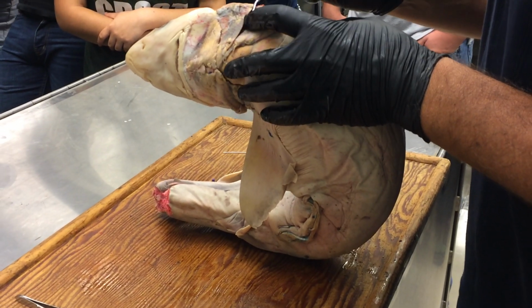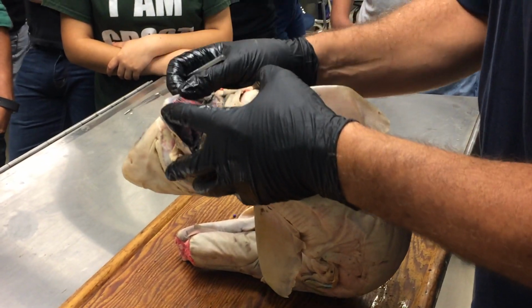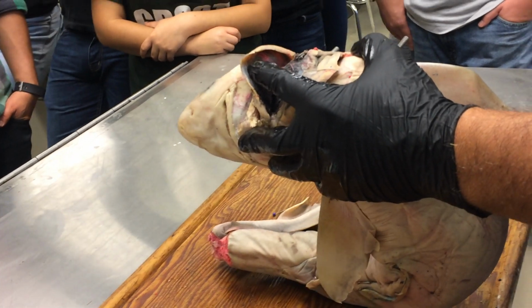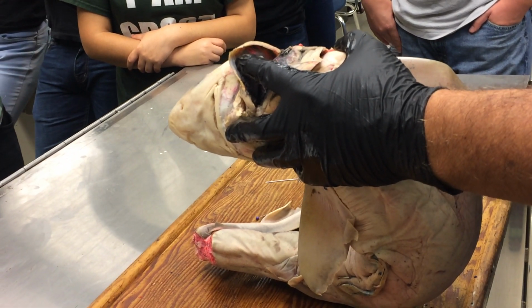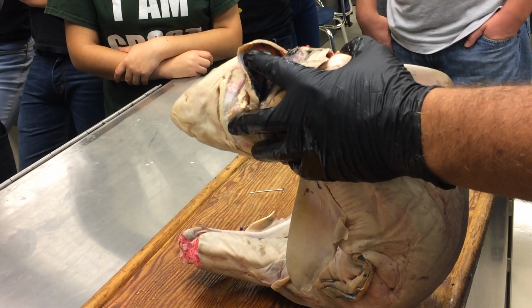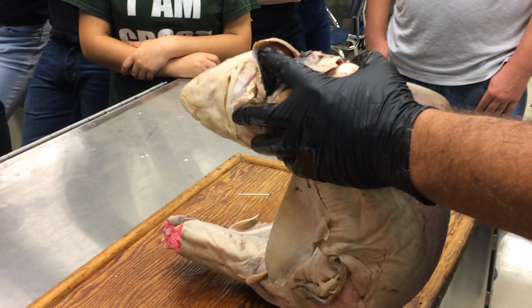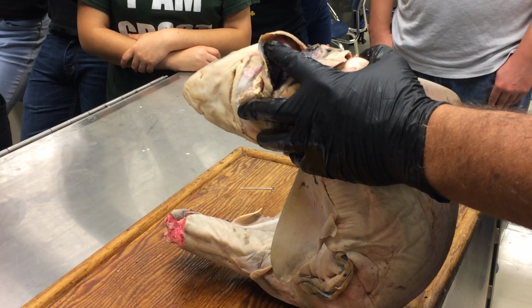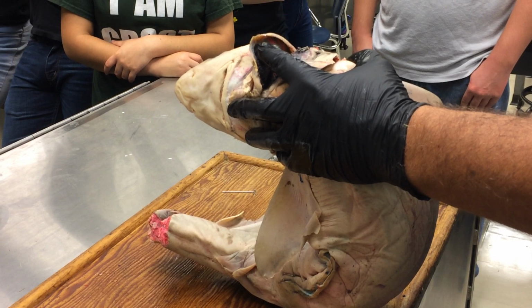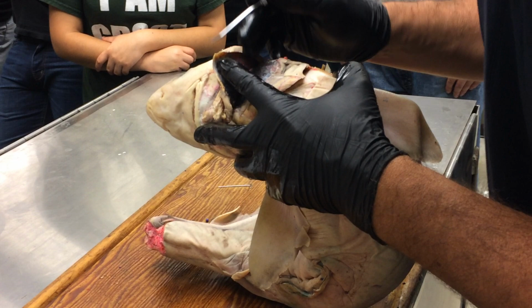The other muscles that we want to look at, we have to actually open up one of the branchial pouches to do that, and looking where the gills are. And each branchial pouch is separated from the next by this septum or partition called the interbranchial septum. And that's what the gills are lying along. If you scrape those gills off, you can see these little rays that run out through the interbranchial septum of cartilage, and those are the gill rays that we saw on the skeleton. And then there's also some muscle fibers in there.